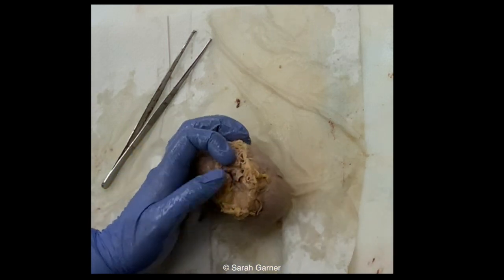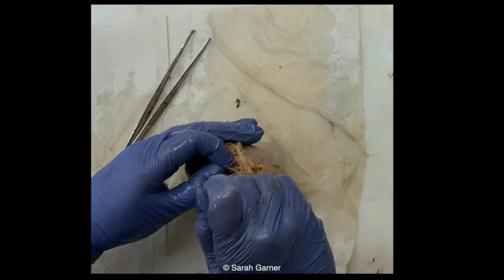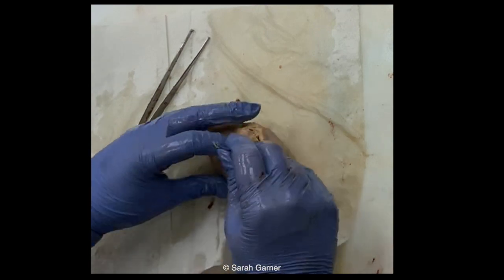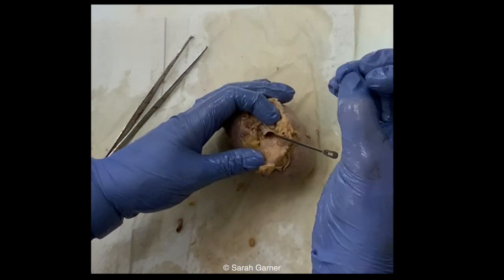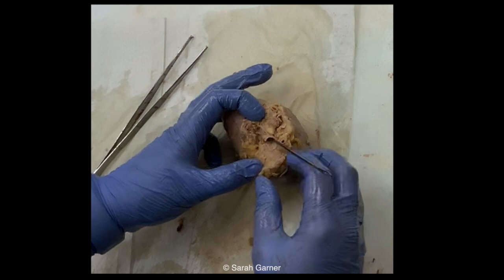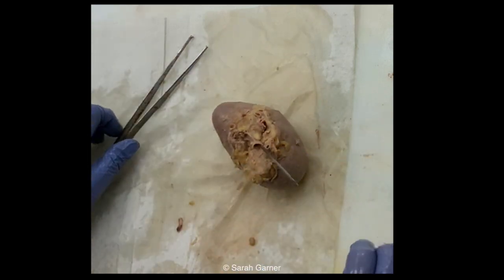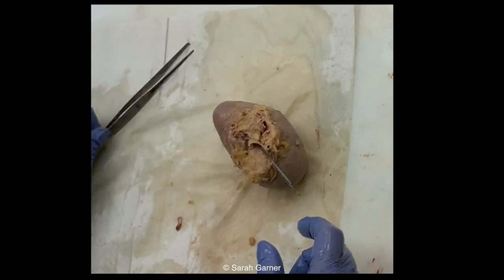All right. So to get a nice open cut, you should stick a probe in through that renal pelvis, right where you had previously opened up that ureter, and stick it till you feel it in a major or a minor calyx, preferably minor. And once you feel like you're in there, you can then cut along that, and that will open it right along that calyceal system, okay?